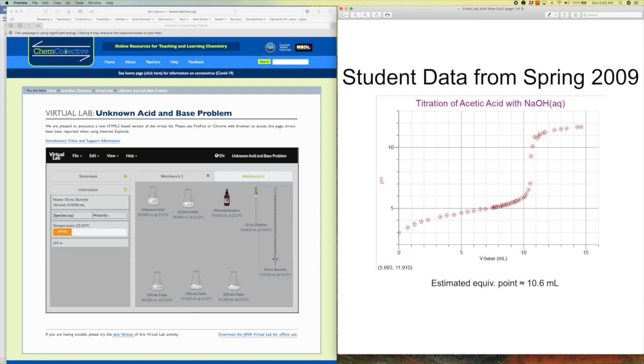And as we kept adding by 1 mL increments, the pH increased by less and less, right? The amount of units that the pH is increasing by seems to be decreasing and hardly increasing at all here, which is what we were seeing, right? The pH was increasing by 0.05, 0.04, right? And this region right here, that is because this is called the buffer region.